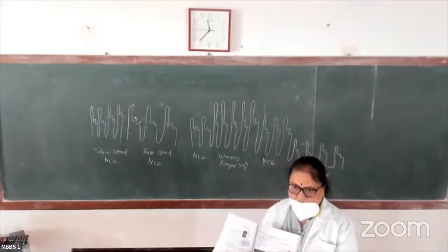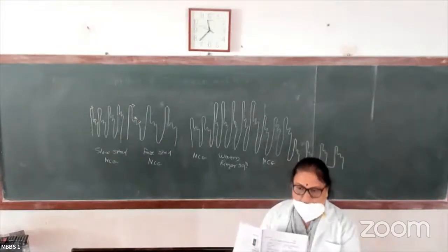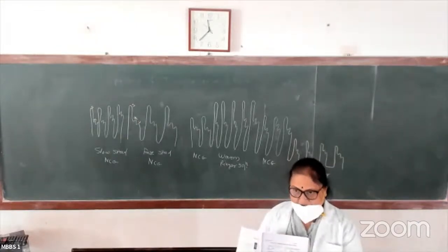Normal cardiogram, warm ringer, cold ringer. Normal cardiogram, warm ringer. Normal cardiogram, cold ringer. One above, one down.